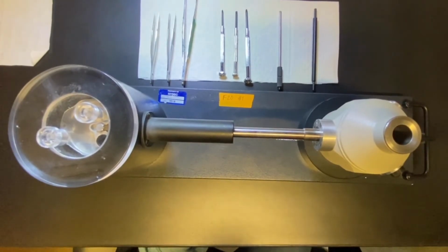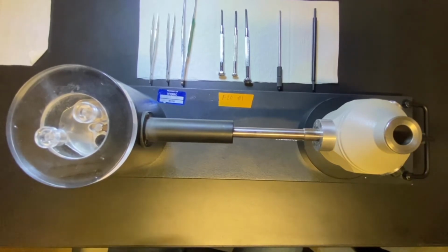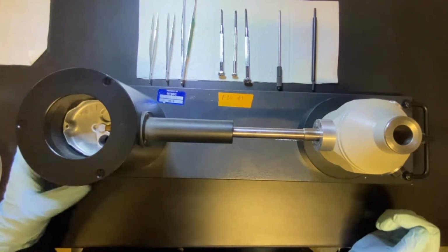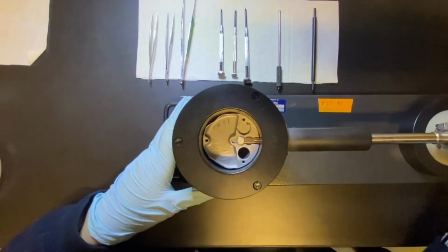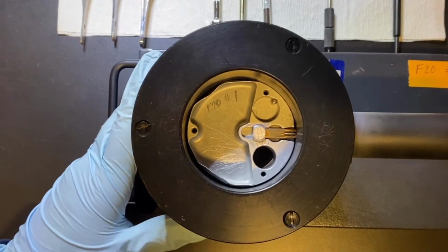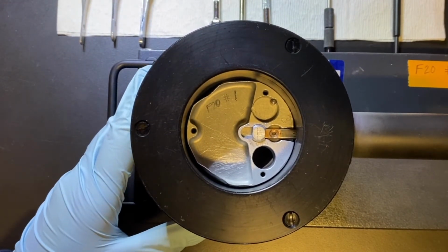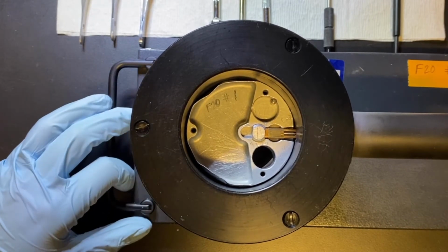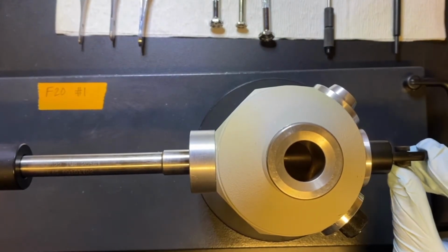Loading the grid onto the holder. This is the 626 holder. We do have the ELSA holder available, however we will use this model for this demonstration. Remove the cover from the stage. To the right is our cooling door, and to the left is our stage. We can open the shutter to reveal the grid. The shutter is always left closed. This is the knob that slides in and out and allows you to open the shutter.